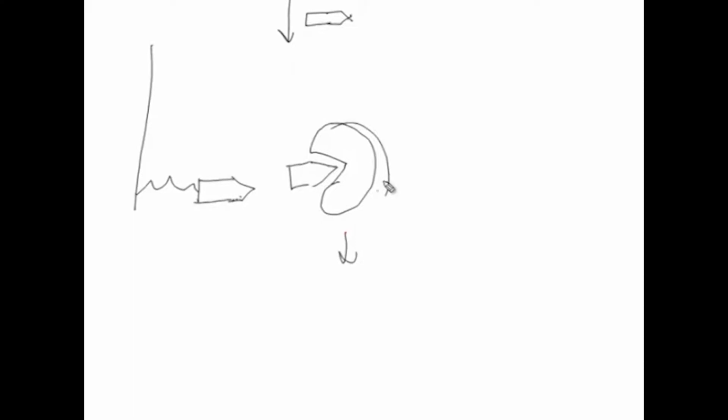So, this is how you will be able to purify the sample very specifically, and it is high capacity and highly selective. Now, you can also elute it by changing the pH and other conditions. So, in a very simple way, this is the basis of affinity chromatography. Alright, let us get into the details of this technique.